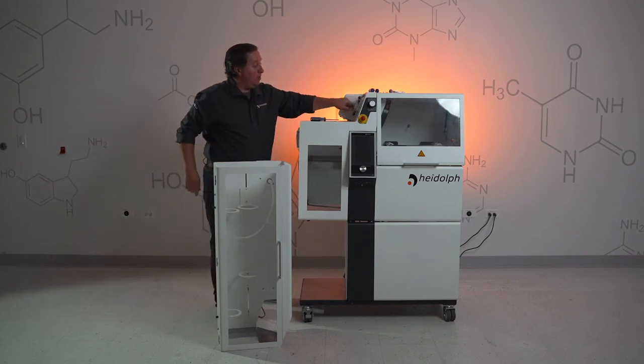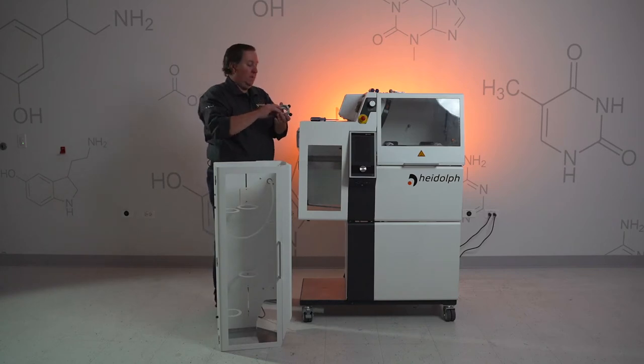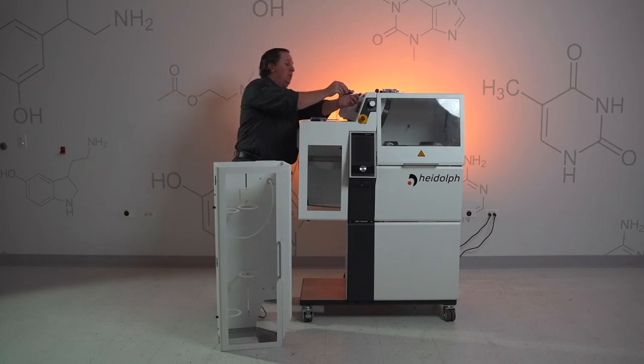Next, we're going to want to remove the retaining collar. With that, you'll have this little threaded collar and then also a split ring insert. And then we have one other little retaining screw between our sensor connectors right here — this is a T10.